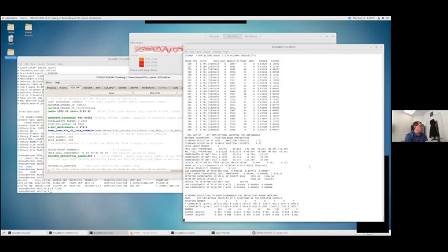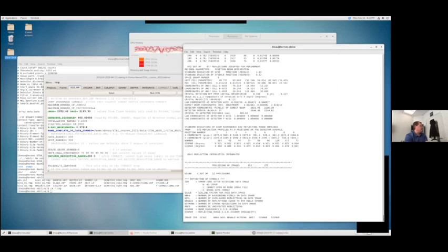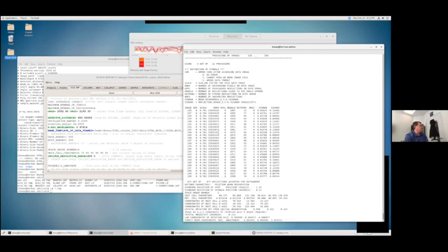What it's doing is breaking the jobs down into blocks. If I scroll in, you can see 226 to 250, so image numbers 226 to 250. So it's looking at about 25 images at a time.